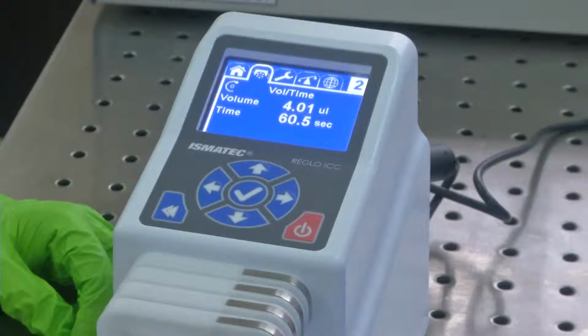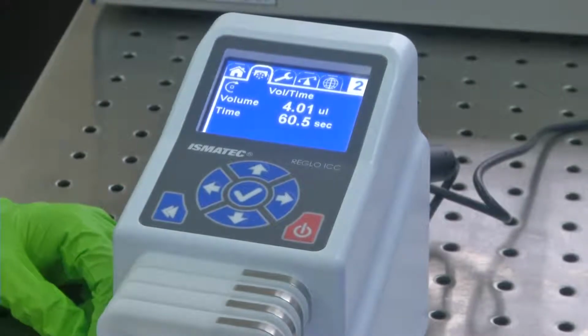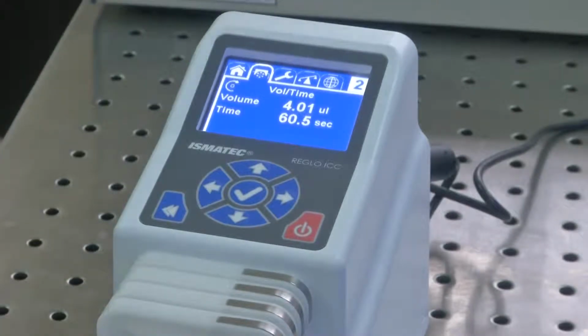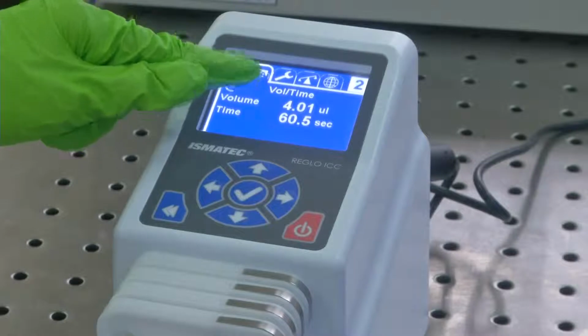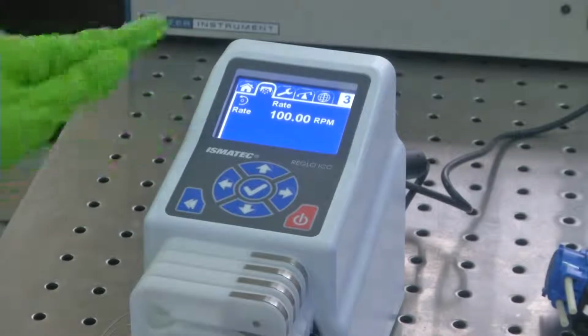and this is a settings option, and now as you can see, we have moved to the second cassette. That is running at 4 microliter per minute. And in what direction? You can see it is running in the clockwise direction. We will also show you how you could change the RPM, the rotations per minute, and even control the amount of fluid which flows and even the time. So let's say this is my second cassette, and currently there's 4 microliter per minute, and this is running at 100 RPM.